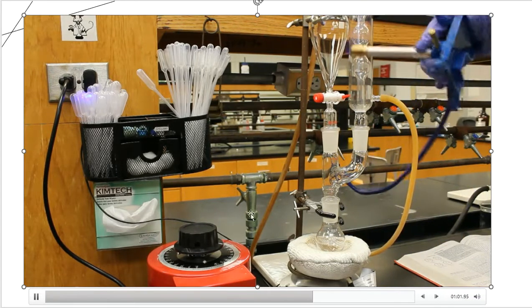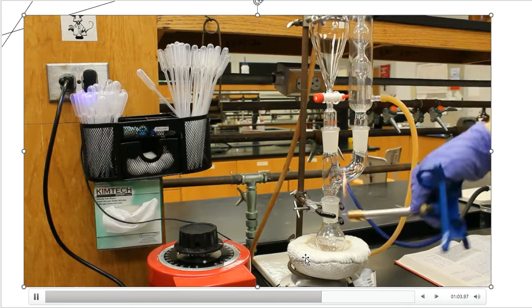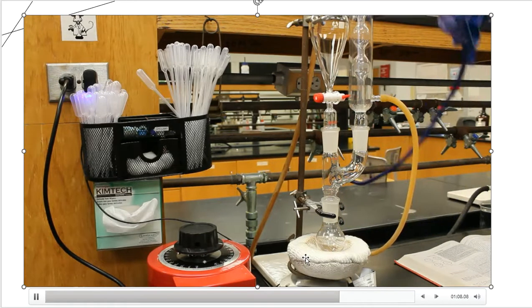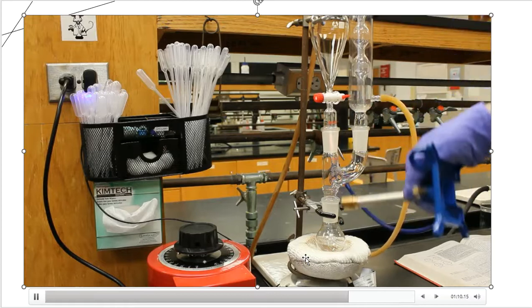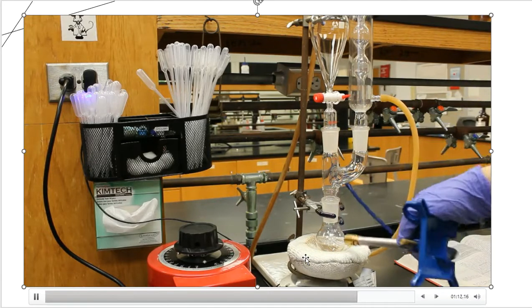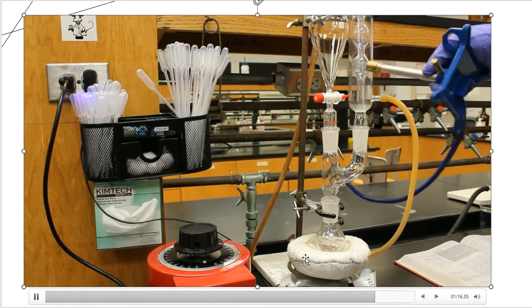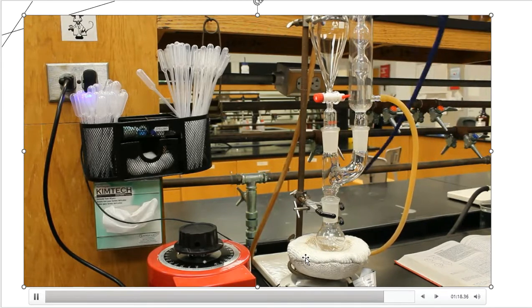So I could have done this in the oven, but actually, folks, I think this is very easy and much quicker if we just do it by hand with a Bunsen burner. If I had a lot of prep work to do for the day, then I would definitely put it inside of the oven and allow that to be ready by the time that I need it. But that's really all that we have to do. So it's as simple as that.